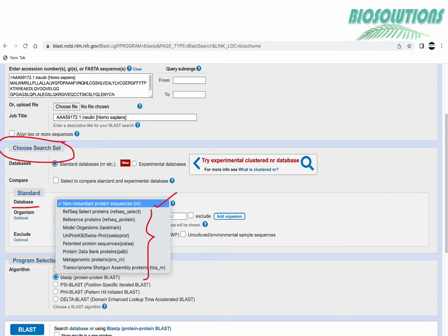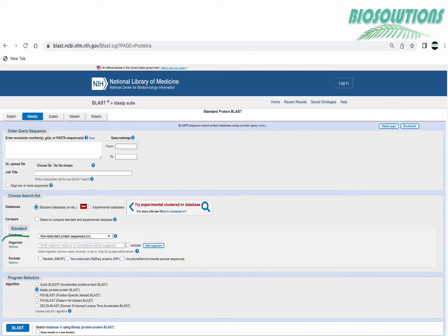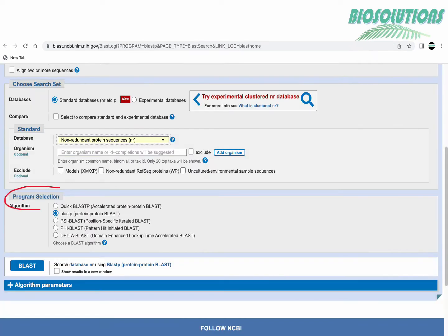Optionally we may like to choose a particular organism only to be included or excluded. If you don't have any such choice you can just leave this option as per default.